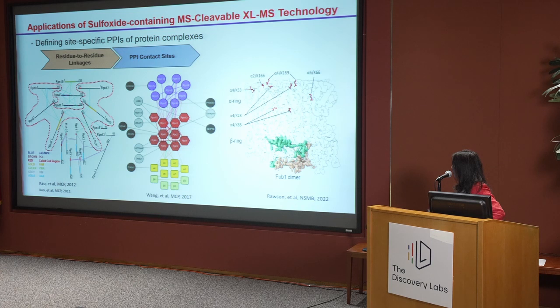Here, we did the in-cell and in vitro cross-linking, and not only did we generate the comprehensive interaction network, but we were also able to capture the interactors, the regulators, and their interaction with the 26S proteasome, including different regulators such as UBL-CP1 as a dephosphorylase of the 26S proteasome.